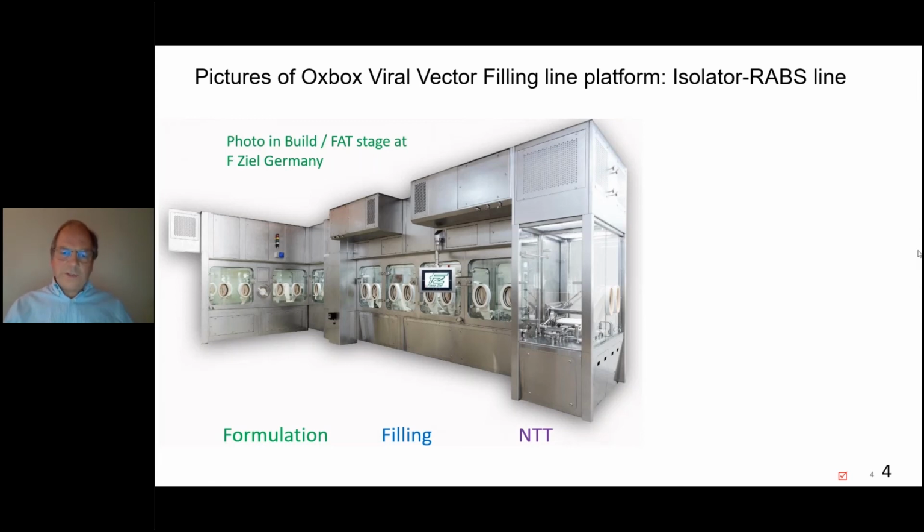The manufacturers of the vials and containers now have stepped up to the game, and there are microbiological challenge studies to confirm that the outside of those tubs is sterile at manufacture and controlled through the supply chain. And that data is now available.